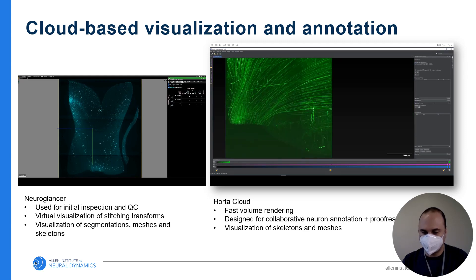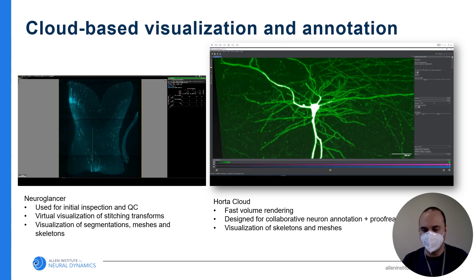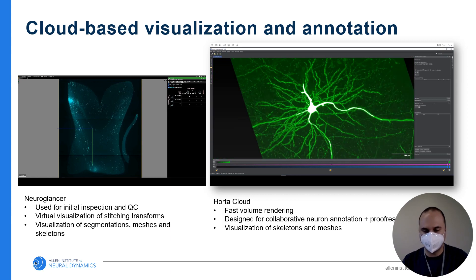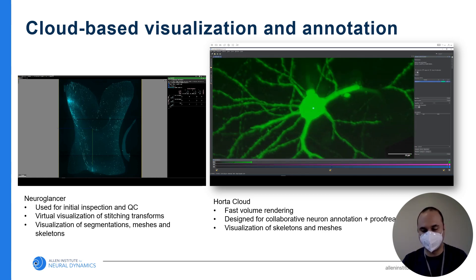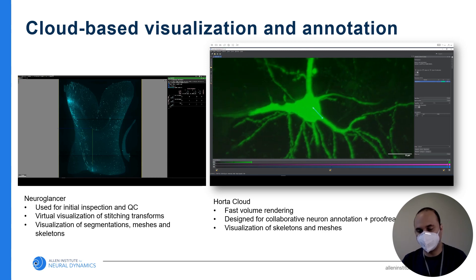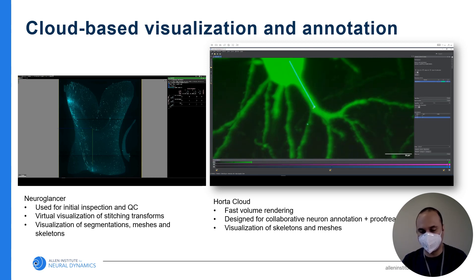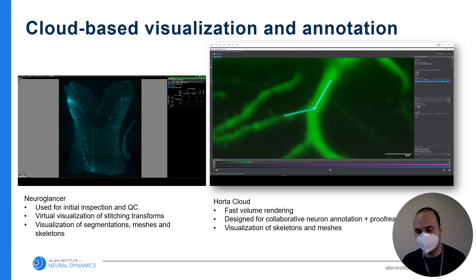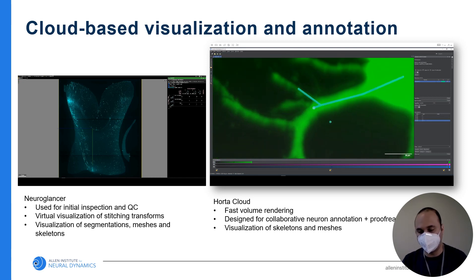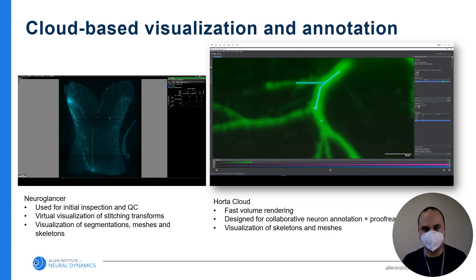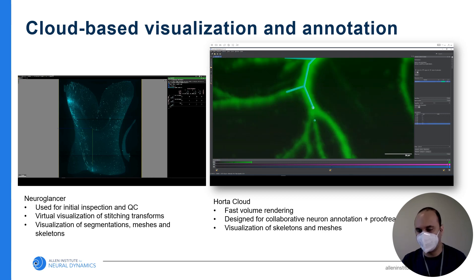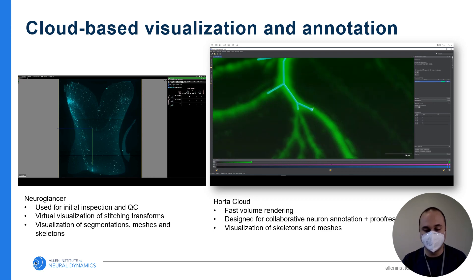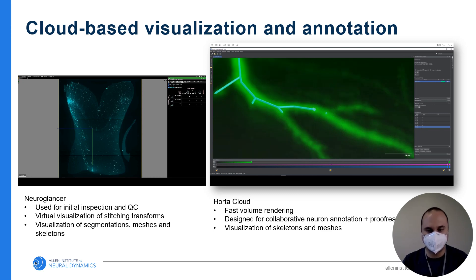Once the stitched volume is in the cloud, we can begin visualizing and annotating the data using several cloud-based tools. NeuroGlancer is a web-based viewer for volumetric data. It displays a 2D view with arbitrary slicing, which is useful for visualizing datasets right as they come off the microscope for initial inspection and quality control. We also use it to visualize stitching transformations on the fly without having to render out the full fused data. NeuroGlancer is also useful for viewing segmentation overlays on the raw data, as well as skeletons and brain meshes.